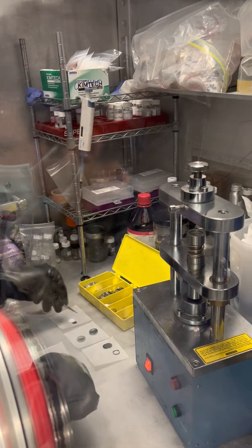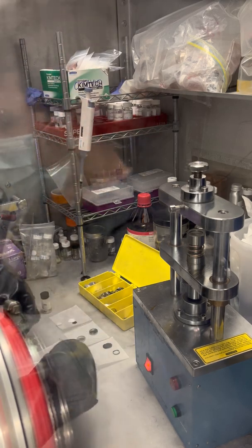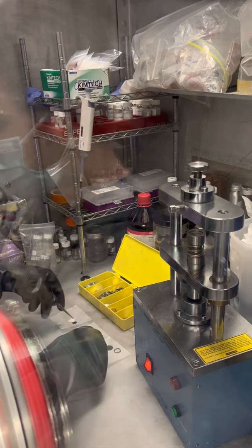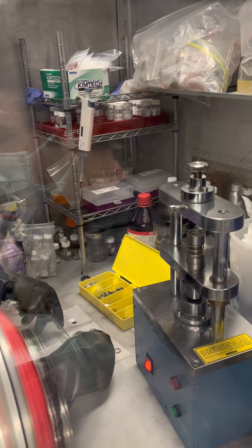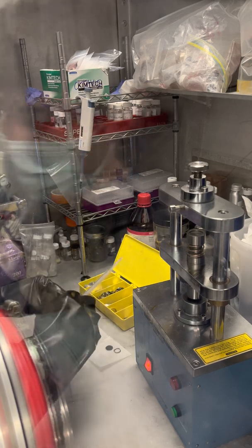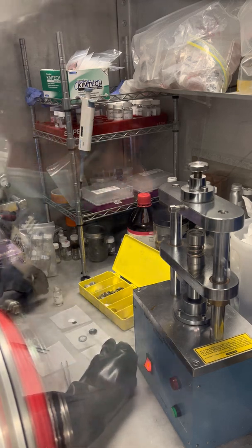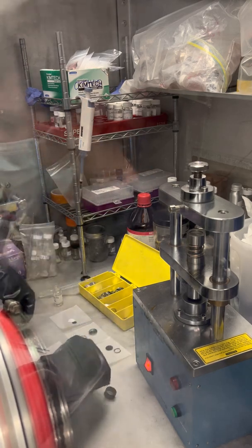First step — preparing the cell. We need one spacer at the top case, and then we are going to start the sandwich: first, the lithium chip, metallic lithium. Then two drops of the electrolyte — the medium that the lithium ions will move inside the cell — on top of the lithium metal.